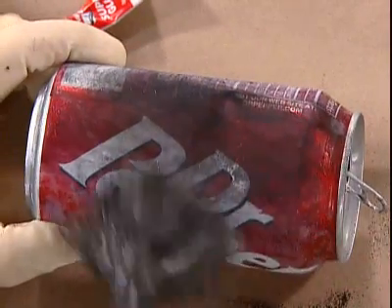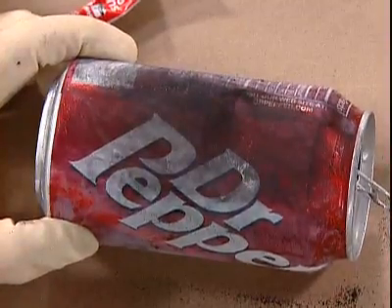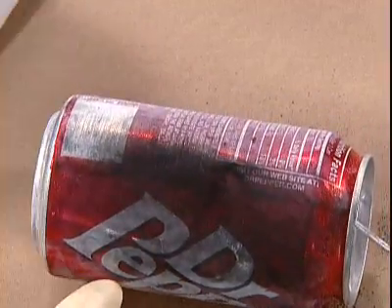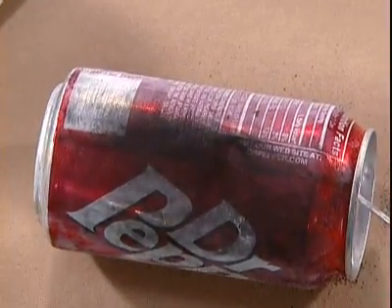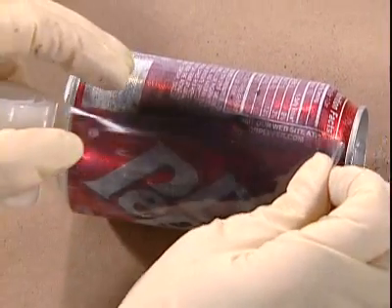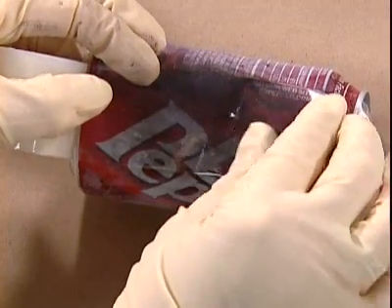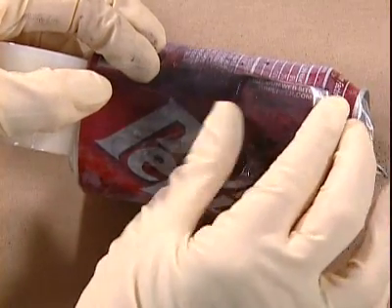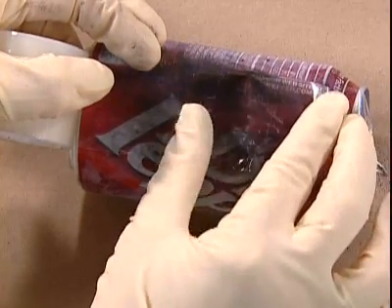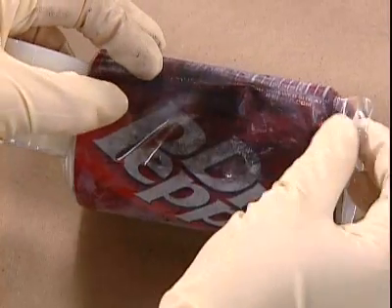And now we've finished the visualization and enhancement, so we need to attempt to lift that particular latent using the same fingerprint lifting tape we've used before. And it's just a simple process, once again, of smoothing the tape over the dusted area and making sure that you get a nice contact here, and then just lift it up.